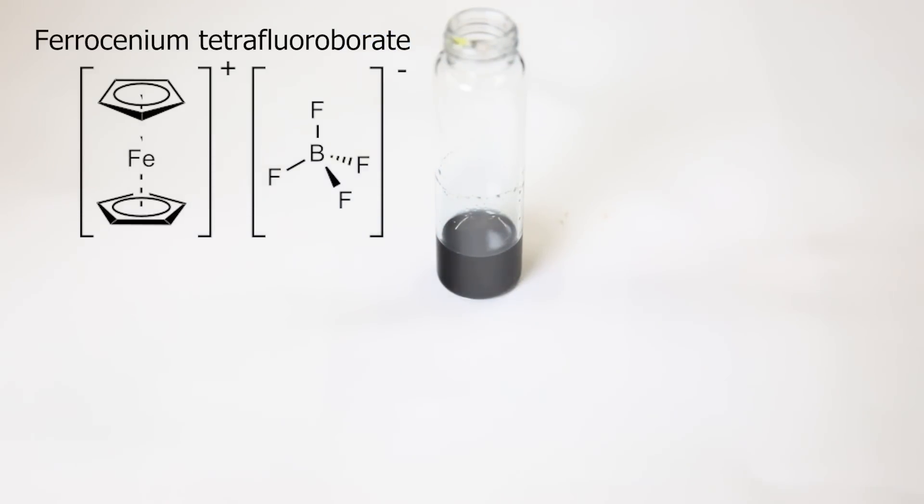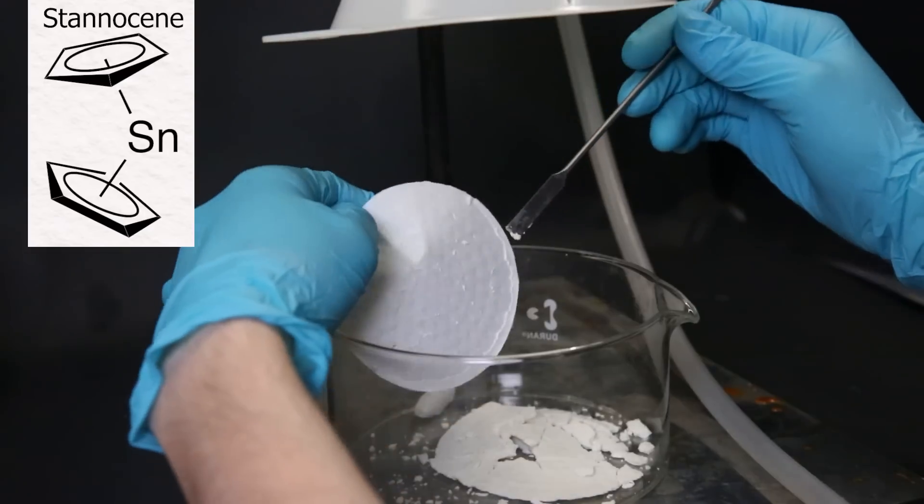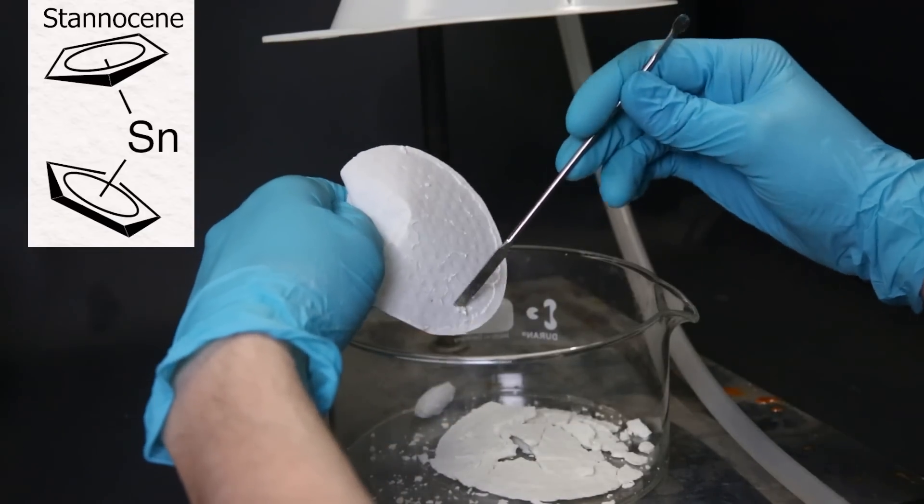So moving on from the ferrocene, I also did this exact same procedure with tin(II) chloride to make stanocene, which is relatively air stable, though not completely. But it was a boring white color, so I will only give it 2 seconds in the spotlight.